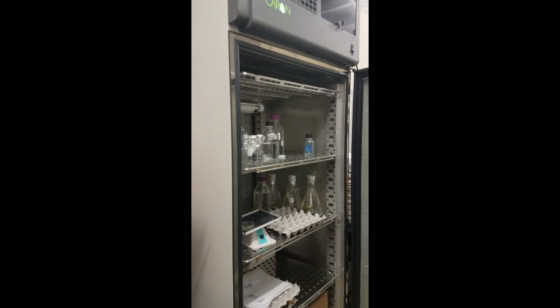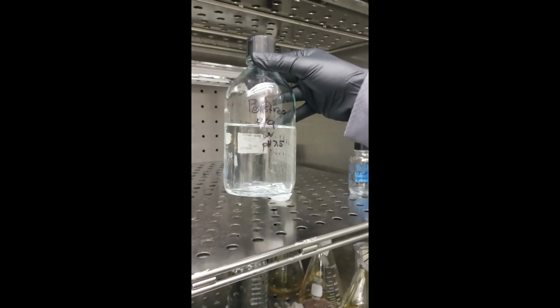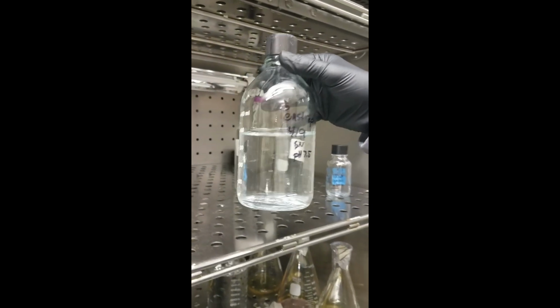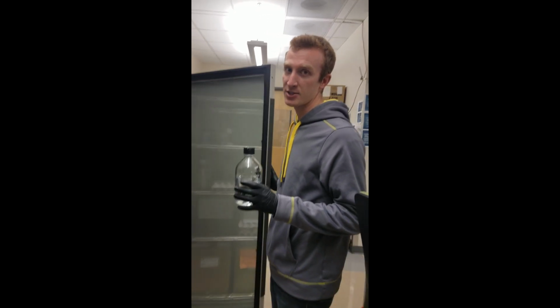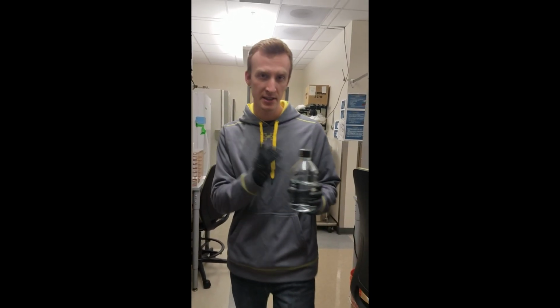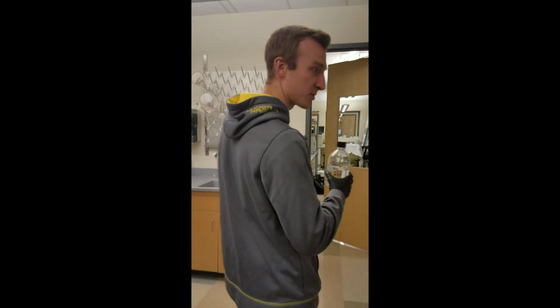You open it up, and here on the top shelf, we have a bottle of pen strap. That's what you want to use. Every 2 weeks, you need to make a new solution of pen strap, because after 2 weeks or so, this solution gets a little old, and it's better just to make a new one to keep the oocytes healthy.